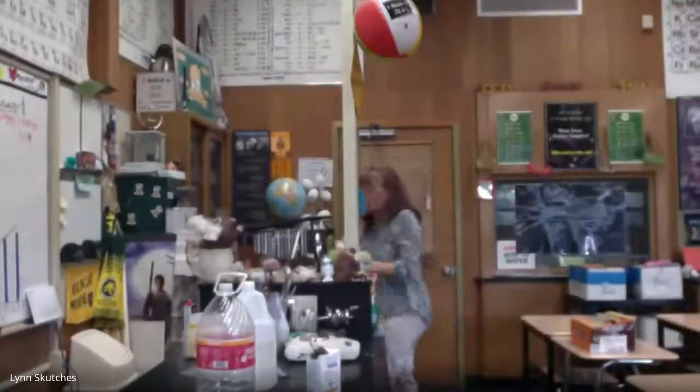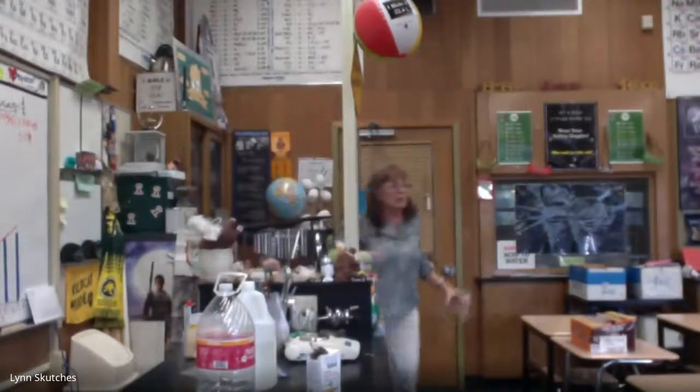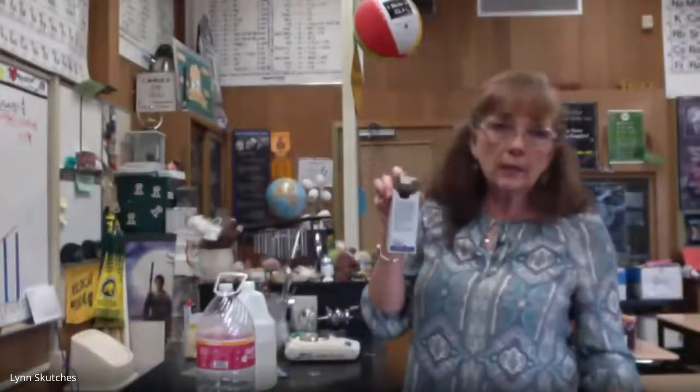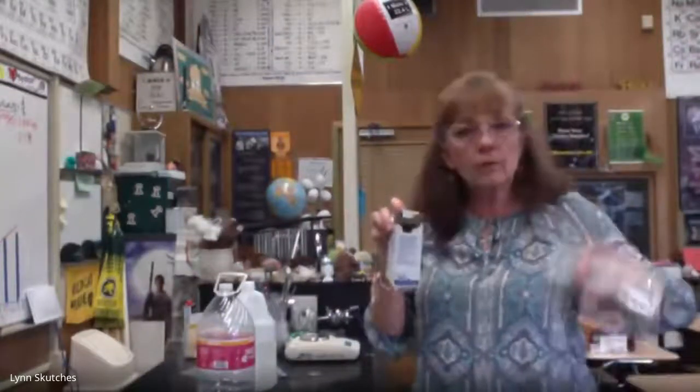Once you're done with that, you're going to rinse everything off. And now do that whole process again with water and baking soda, same process. Get the temperature to start, then add the baking soda, stir it up, get the final temperature.